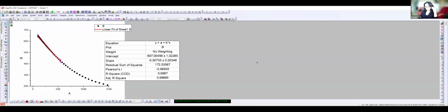So as I said, I have the resonance frequency in hertz, I have the relaxation rate in second to the minus 1, not for instance milliseconds to the minus 1. So okay, I determined the slope. Then I will stop sharing because I have to switch to something else.